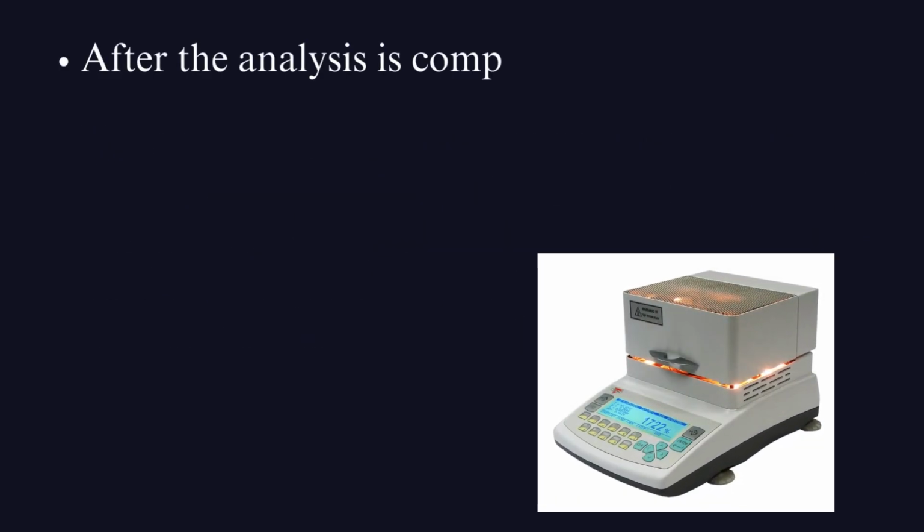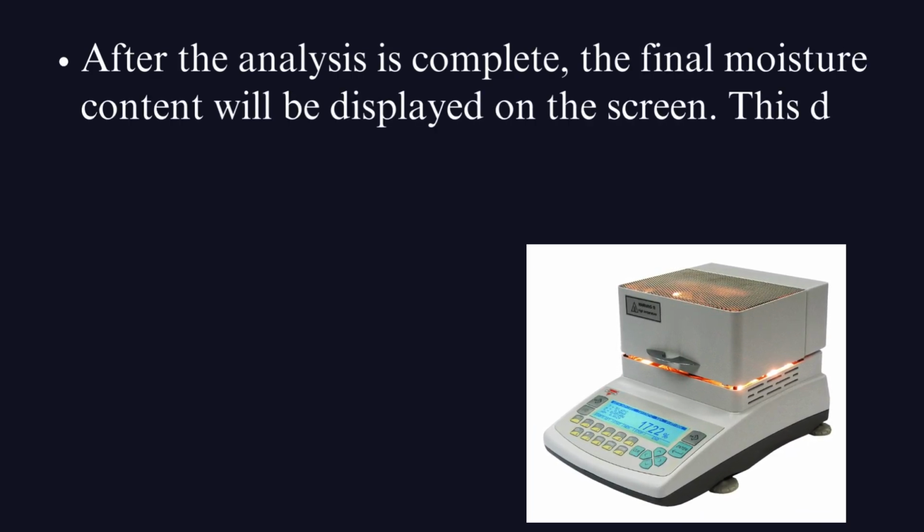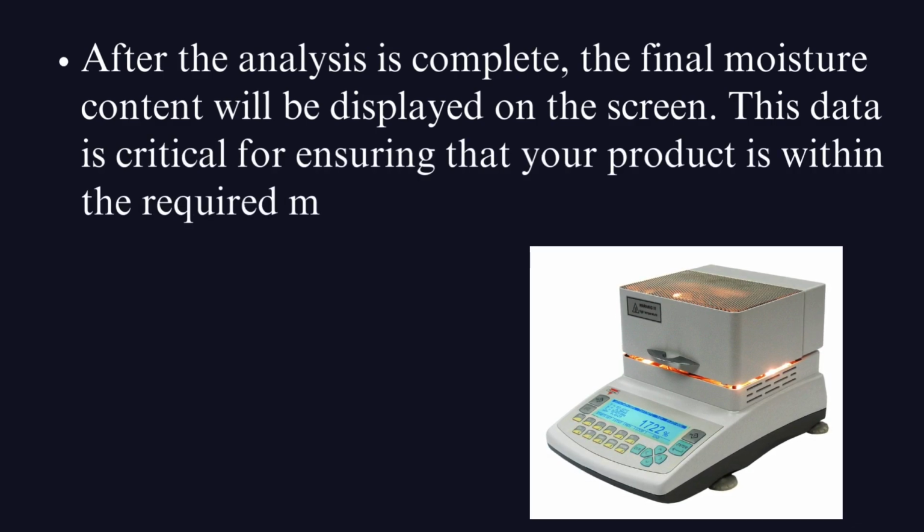After the analysis is complete, the final moisture content will be displayed on the screen. This data is critical for ensuring that your product is within the required moisture specifications.